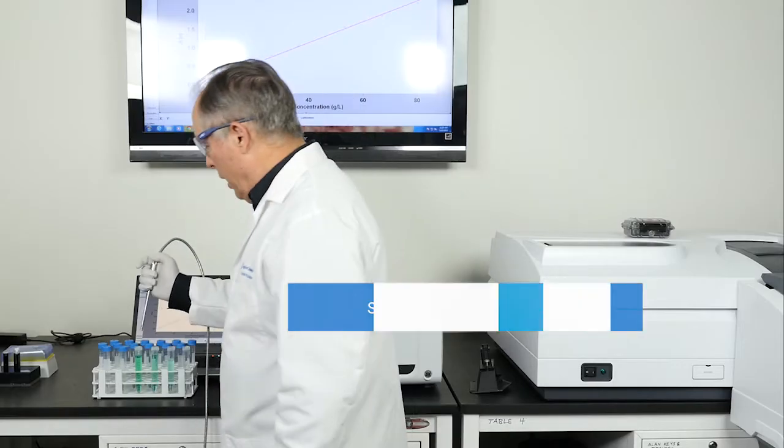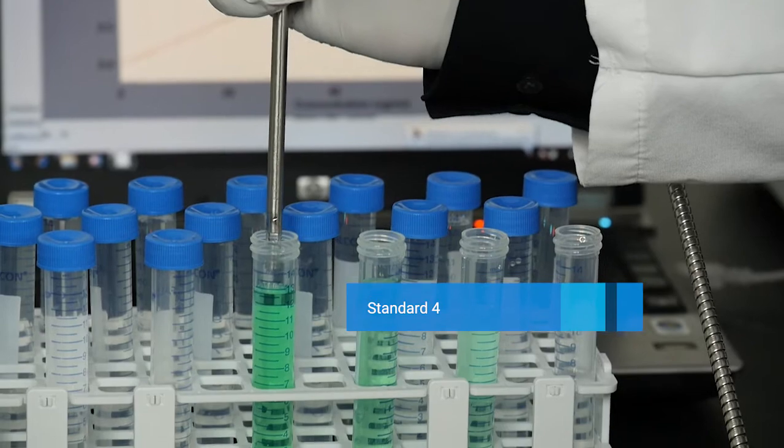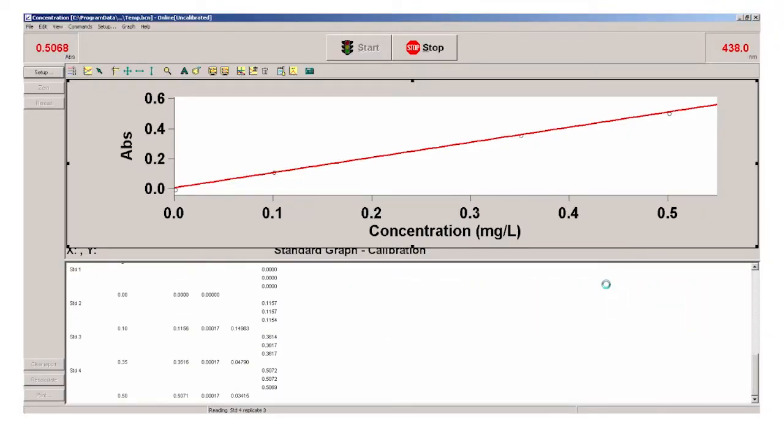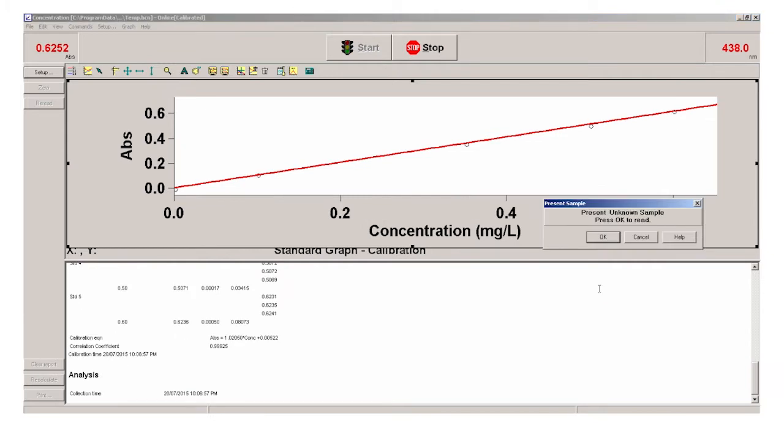And now our final high concentration standard. So in a very short period of time, we were able to construct a calibration curve, and now I can measure all of my unknowns.